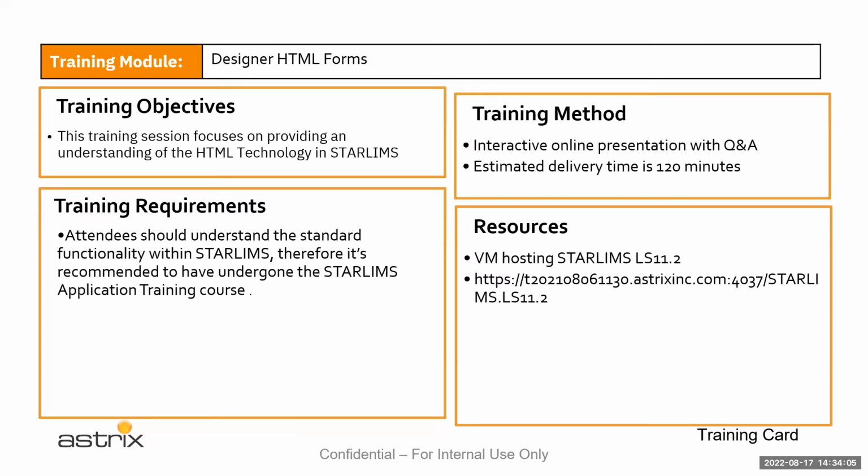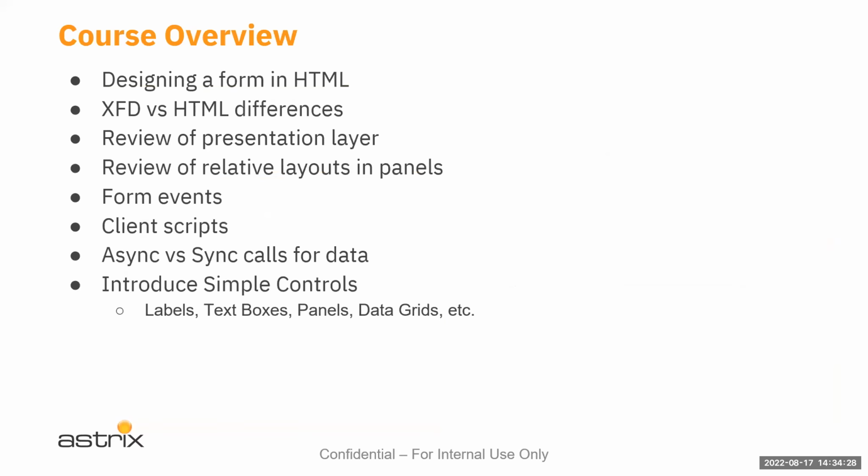We're going to have concepts here that are pretty simple, like relative layouts. It's basically how the controls get aligned on the screen, but it takes some practice to get used to. You'll see one slide presenting all the options, but until you play around with it and see how the controls behave, it's hard to grasp. We'll see, I'm getting ahead of myself. All right, so the course overview is this.